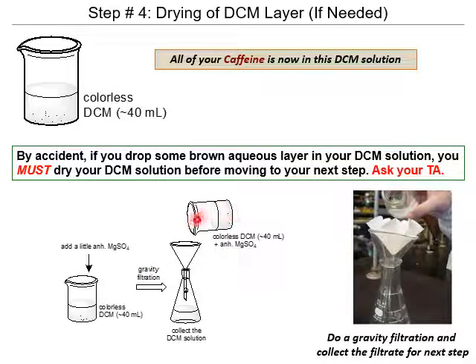You pour in the solution with magnesium sulfate in it, and the solution that you want will drop here, sometimes dropwise, sometimes very quickly, and the magnesium sulfate will accumulate here. It's very important to remove the drying agent so you can conduct a further reaction later, or whatever you might need with it, so that the drying agent does not interfere, right?